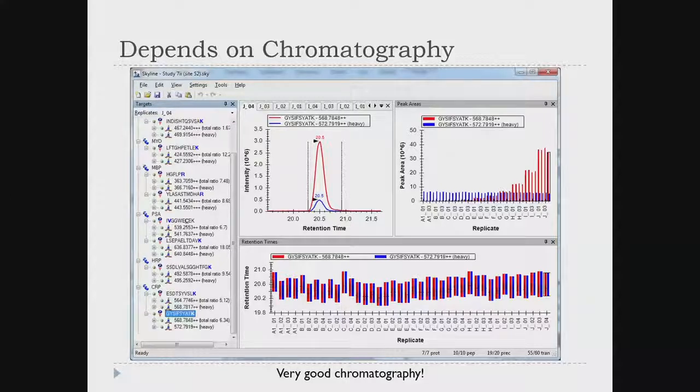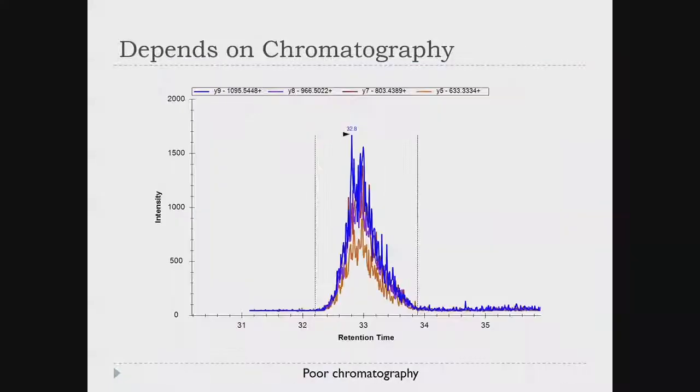And here is super nice chromatography. It's very, very stable retention time, and then nice smooth half-minute peaks. The isotope labeled standard is very straight across here. And this is a response curve experiment, a calibration curve. Even without any normalization, you can see very stair-step peak areas for each concentration.